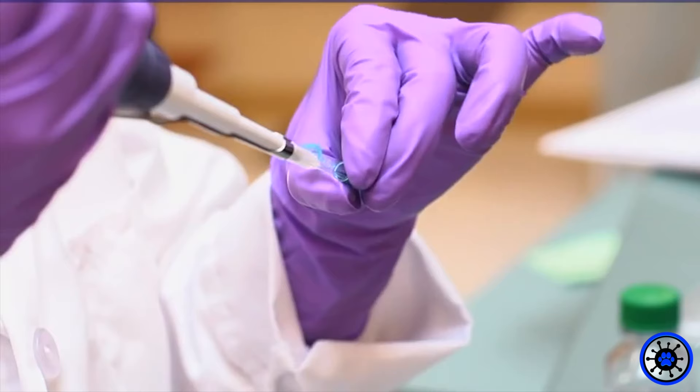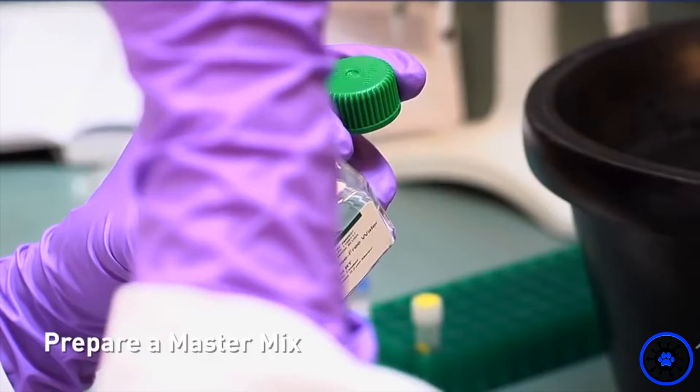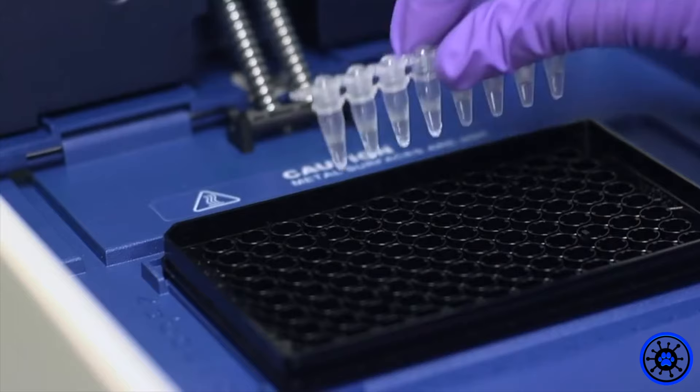Once RNA is isolated, use Qiagen 1-step RT-PCR kit. The kit contains a reverse transcriptase which creates cDNA from RNA and a polymerase which amplifies cDNA via PCR.